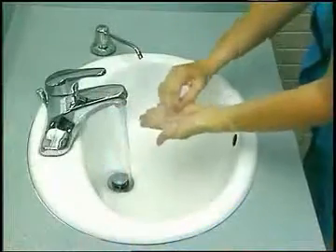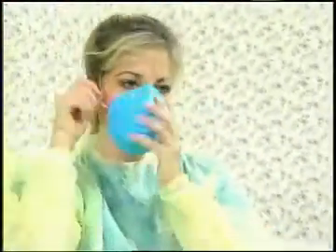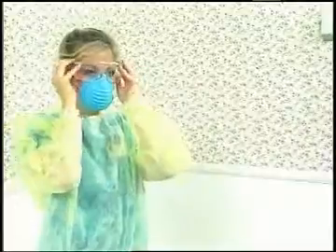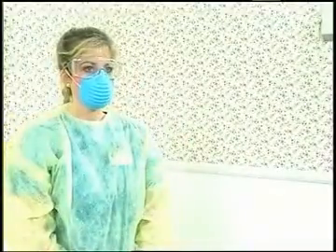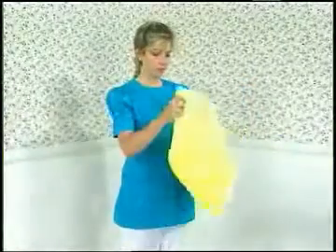Always wash your hands before putting on personal protective equipment. Face masks and eyewear protect the mucous membranes of your eyes, nose, and mouth whenever there is a chance that blood, body fluids, secretions, or excretions will splash, splatter, or spray. Some face masks may become ineffective when they get wet. A gown may be used to protect your clothing.